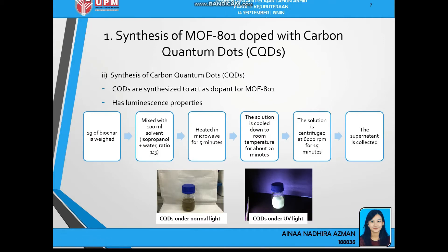Next is the synthesis of carbon quantum dots. The CQDs are synthesized to give CQD-MOF801 luminescent properties for copper detection. 1g of biochar is weighed and mixed with 100ml of solvent — isopropanol and water at a ratio of 1:3. It is heated in a microwave for only 5 minutes, then cooled down for about 20 minutes. The solution is centrifuged for 50 minutes at 6,000 rpm and the supernatant is collected. Under UV light, the synthesized carbon quantum dots exhibit luminescent properties.